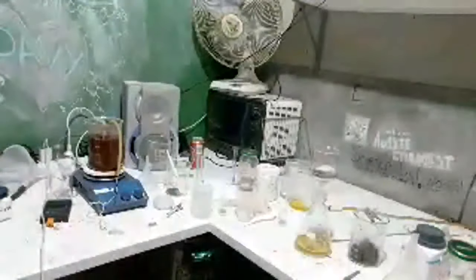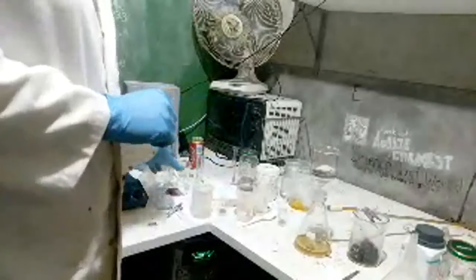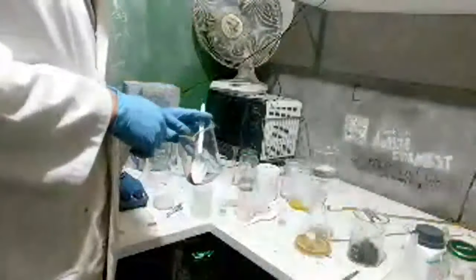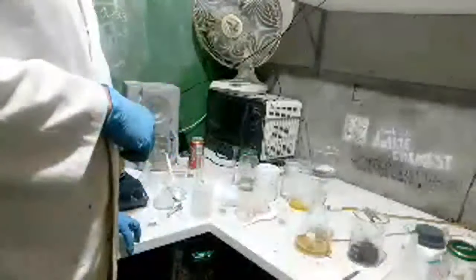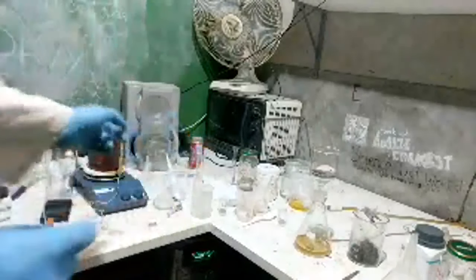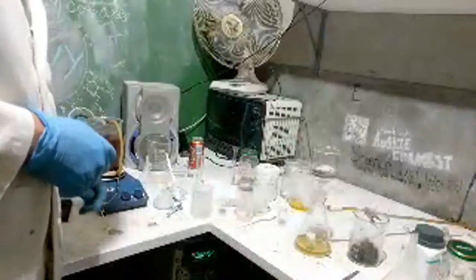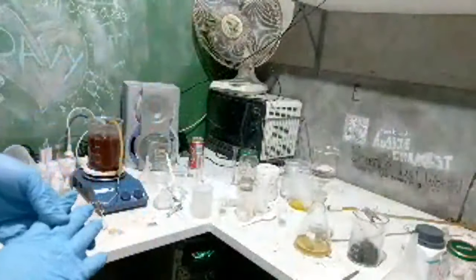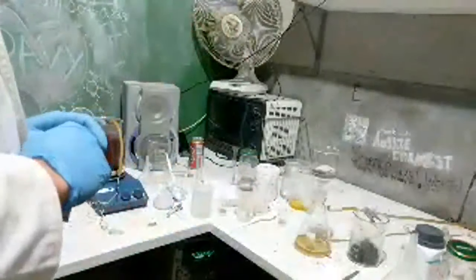That's the thing, it either takes forever or it doesn't work at all. So we're probably going to have to make iron hydroxide and then add it to the bleach later on, I think. Let me think about why this didn't work. But maybe the iron hydroxide is just so insoluble that it just doesn't react at all. Either that, or my hypochlorite concentration is very low, but even then, if it's low, it should just work, but just not to a good extent. But we're seeing it really not work at all.